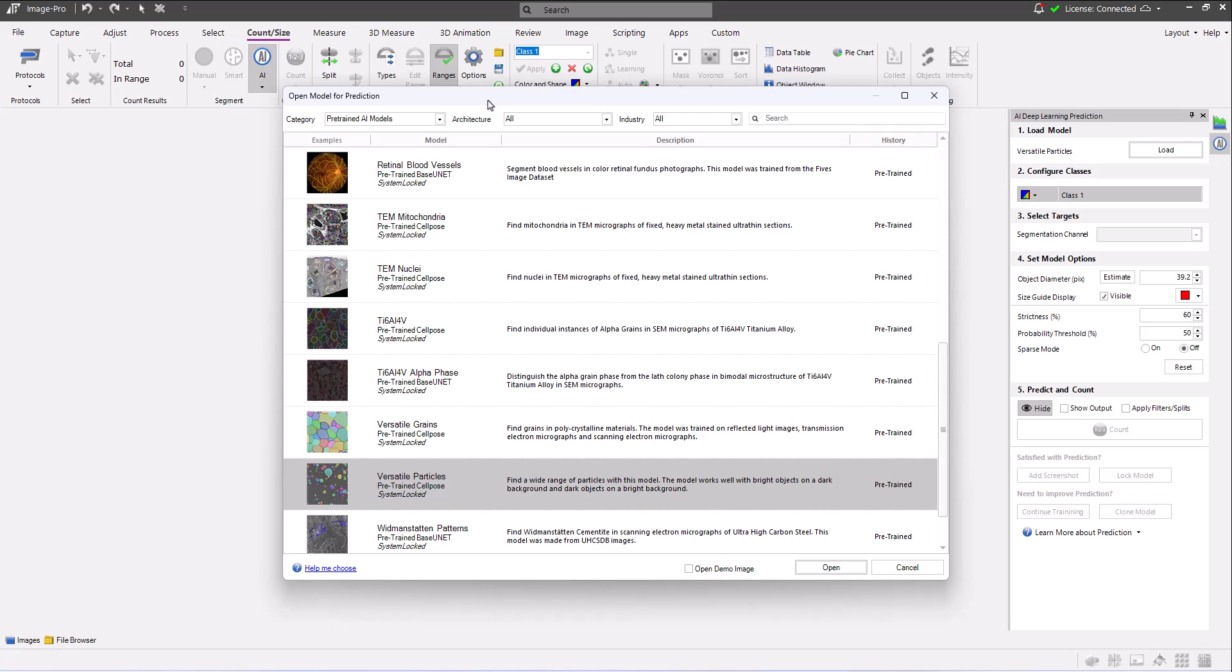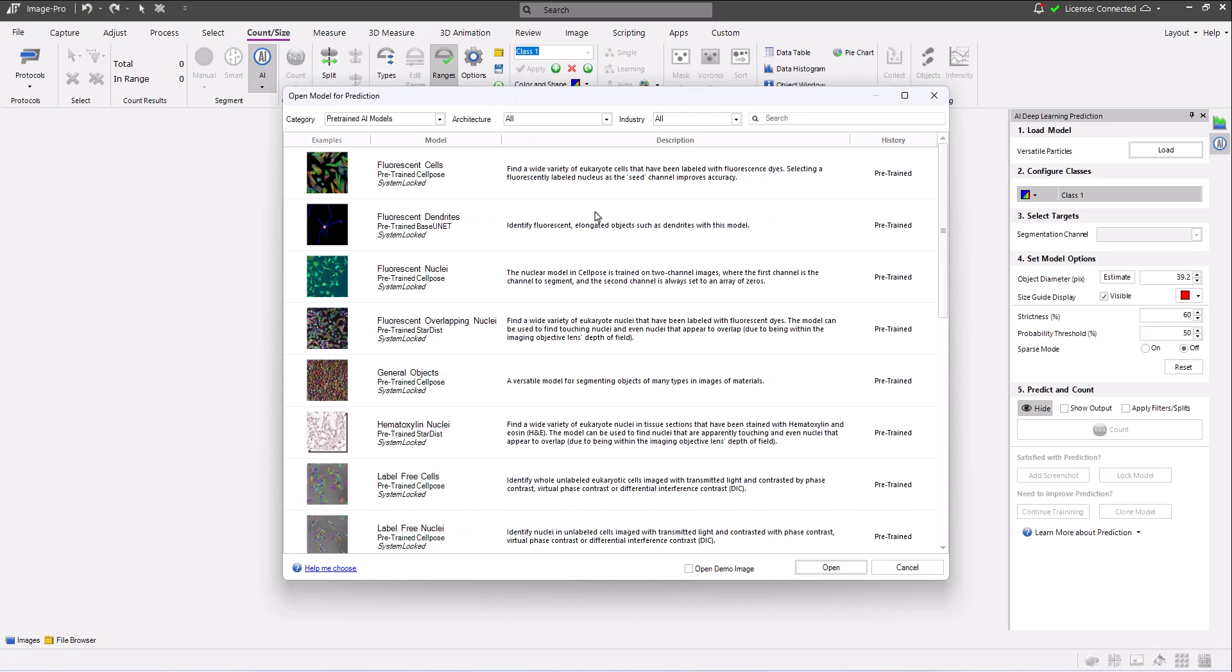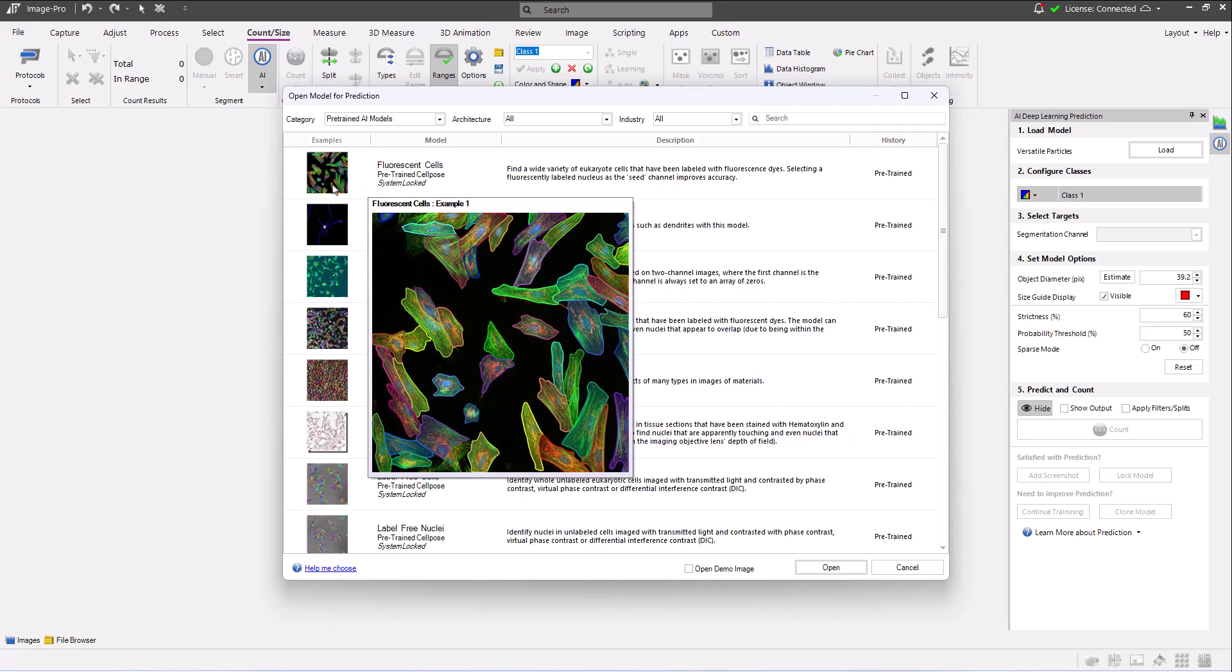In this dialog, you see each model's name, a description of the model, and the model's history. If you move your cursor over the example thumbnails, you can see a clear example of the kind of objects the model was trained to find.